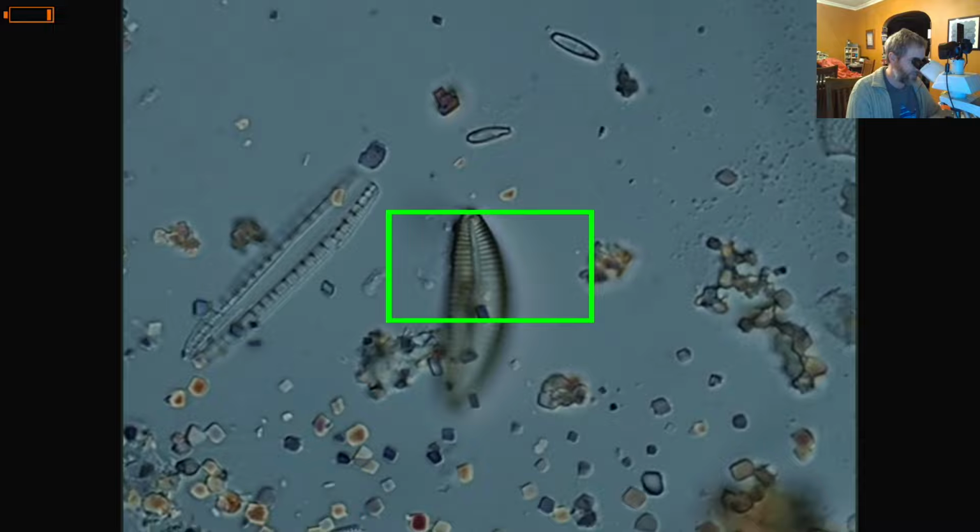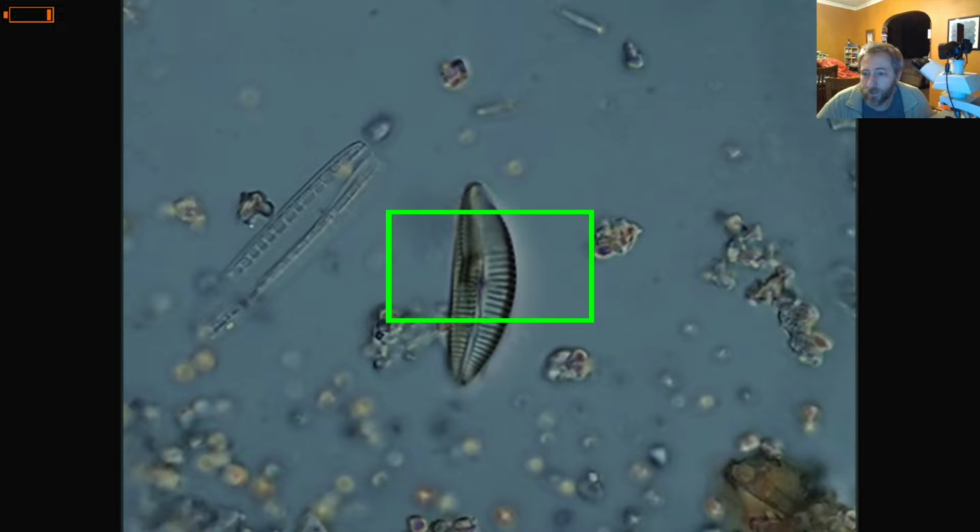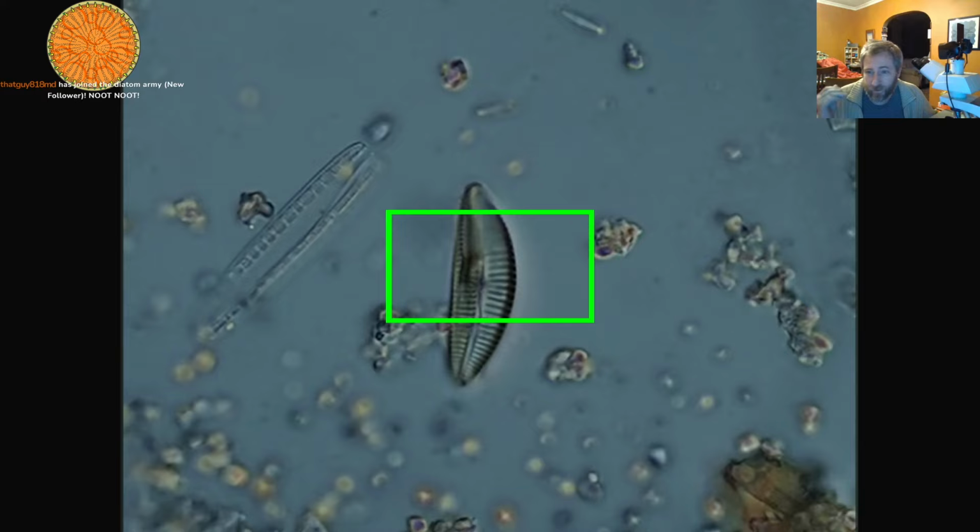That is one we haven't seen at all. It looks like it's a tiny little cymbella. So that's an example of how you could use it in those settings. In terrestrial settings, it's a little bit more challenging.